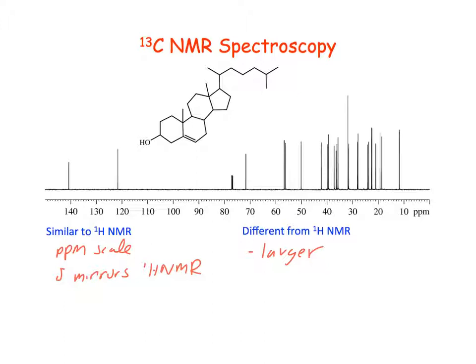The places that we would tend to see negative chemical shifts is if we have a very electropositive group attached to a carbon, so it's pushing electron density back onto the carbon. TMS is still at 0, so it's more like methyl alkyl metal compounds, alkyl lithiums or something like that, where you have a plus on the metal pushing electron density onto the carbon. That would cause a situation where it's very shielded, right? Larger delta range.